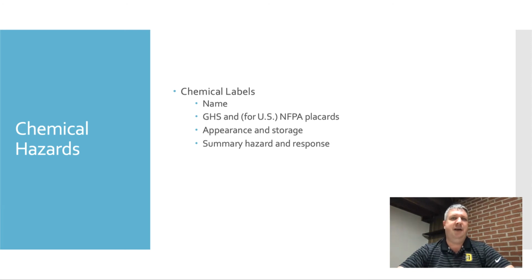You're not going to fit everything on the label of a bottle. If you really want to know everything, you go to the SDS, the safety data sheet. These have to be kept on site for everything that is identified as a chemical. This is not true for your house, but every chemical in your house, be it dishwashing detergent or Windex or whatever it happens to be, it should have a label.